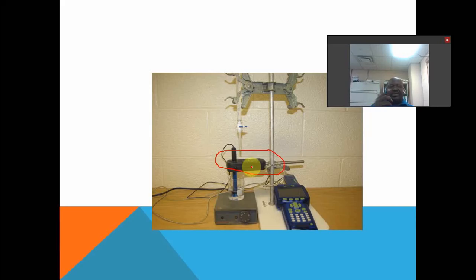The drop counter counts drops, but we want to convert from drops to milliliters of whatever reagent is up here in the burette. So what you're going to do is run the burette, start with a certain volume, go 55 drops, read the volume, and look at the change in volume, and say, let's say 2.3 milliliters is equal to 55 drops. You'll feed that information into the data logger, and then as it counts the drops, it will automatically go from drops to milliliters.